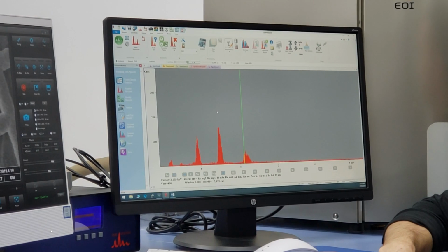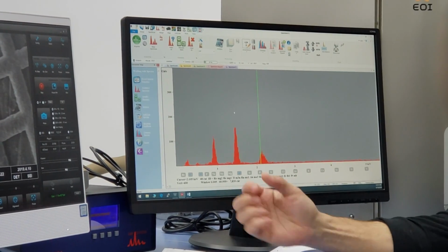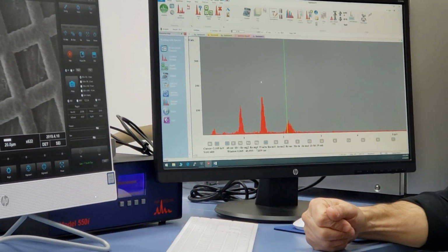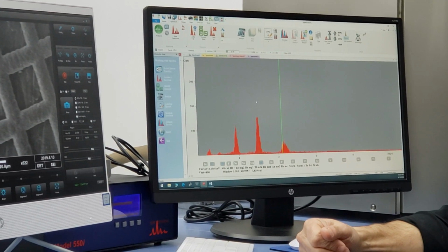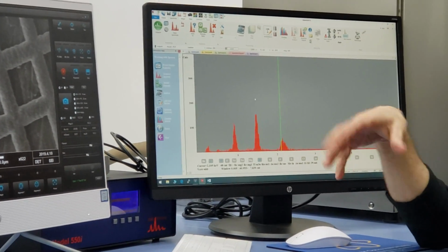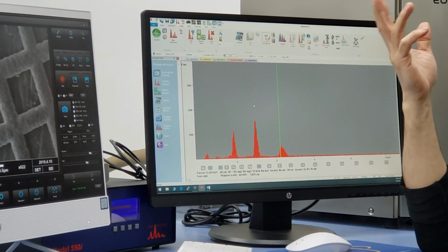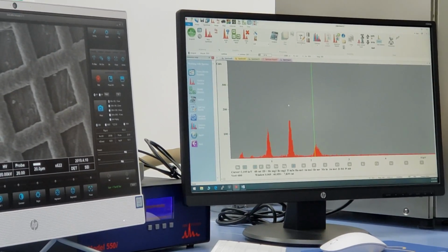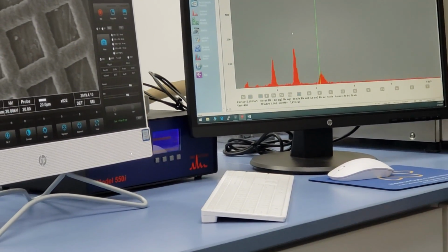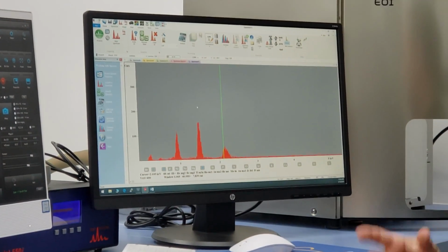You could buy an etcher. Yeah, a sputter coater / etcher. Basically, you insert your sample into an etcher, and it removes any surface contamination from the sample. We could supply one of those for you guys. They're like $7,000. It does both. Not only does it coat, for instance, on older SEMs, everything gets sputter coated. Like Dan's SEM, he has a sputter coater and an etcher. So he's coating with gold palladium or whatever he's using to coat, but then you can etch that sample too. It has a flap that comes over, it puts a bias potential on the flap and pulls all contaminants off the sample surface. Or you could try alcohol, methanol, drying.